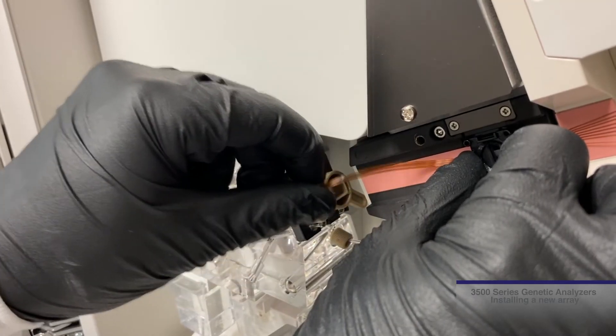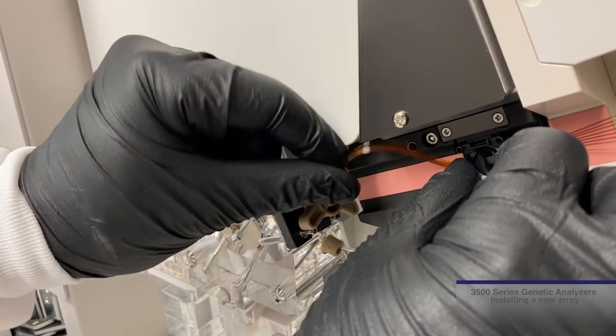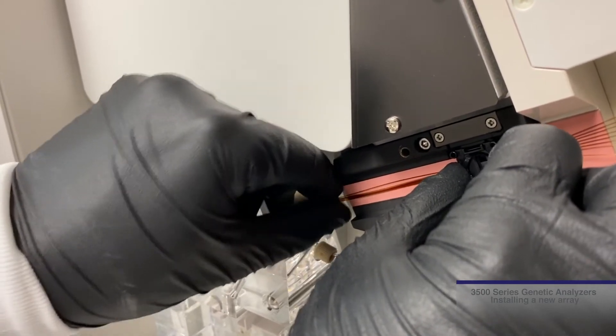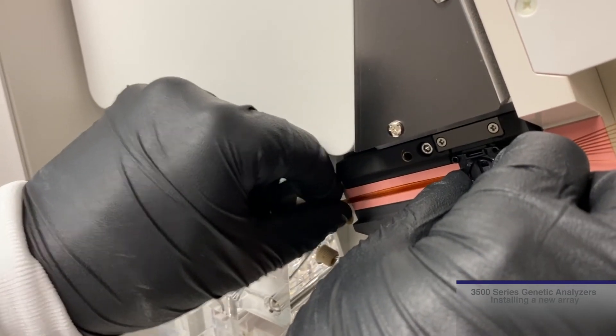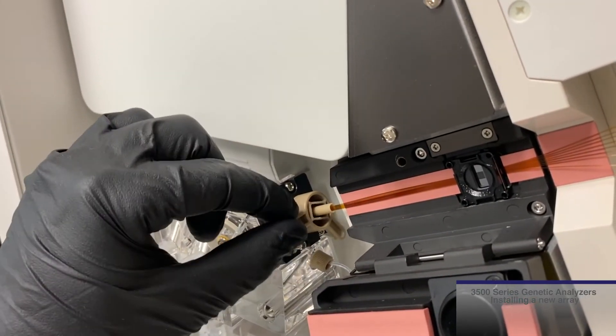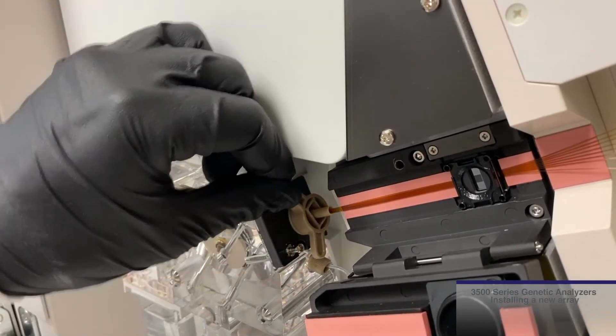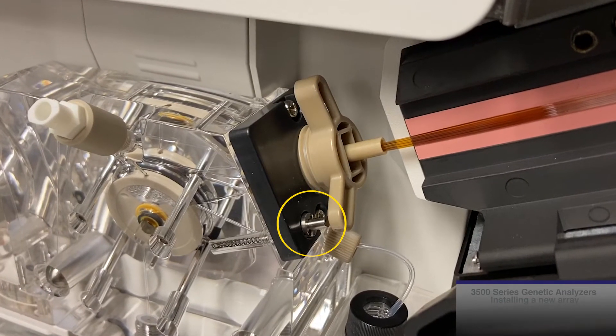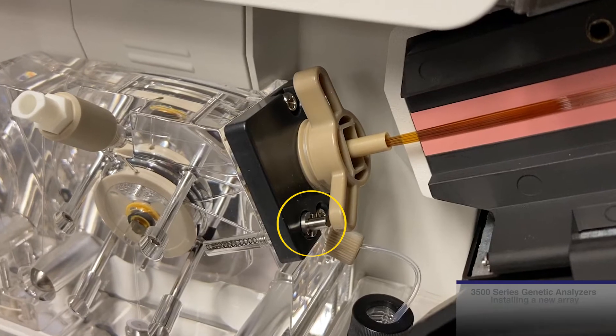Place the tip into the array port, aligning the rectangular part horizontally into the array port. Notice there is not a need to twist the array. Once positioned, turn the lock mechanism about one-quarter turn clockwise to tighten. Note the silver pin can be used as a guide for loosening and tightening the array into position.